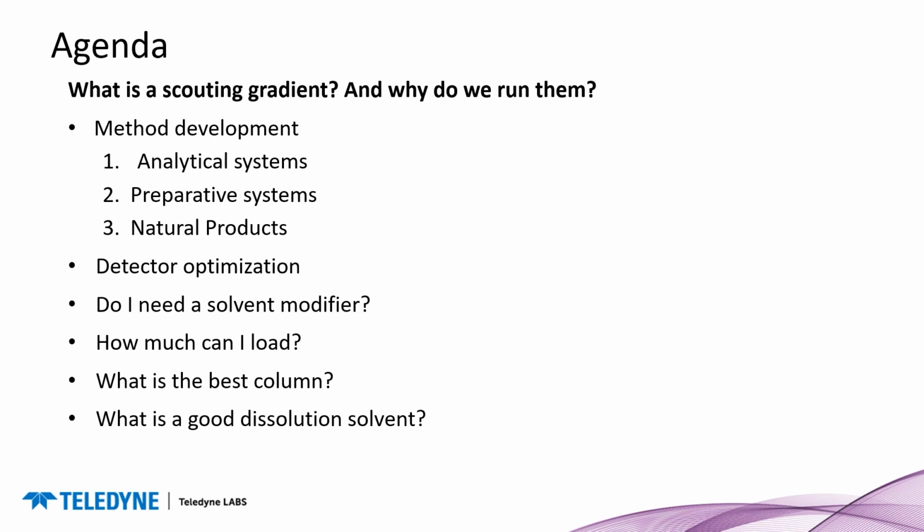Assay-directed method development is useful for natural products. Scouting runs also allow for detection optimization. They can suggest loading capacity, how to dissolve the sample for the big column, and also how to see the best column and solvent system to use.